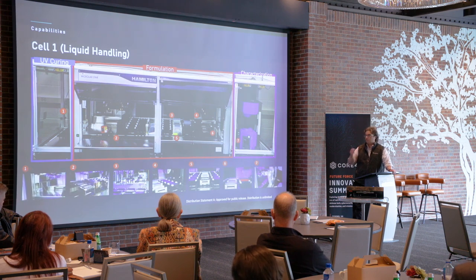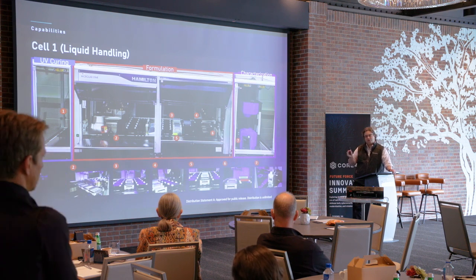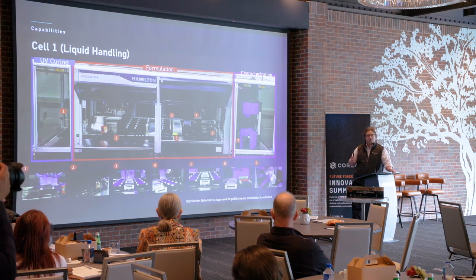It can move samples and substrates on it, around the deck or off the deck. We have 8 independent pipetting channels, so we can aspirate different amounts of materials to different locations on the deck simultaneously. We can uncap vials, we can recap vials.